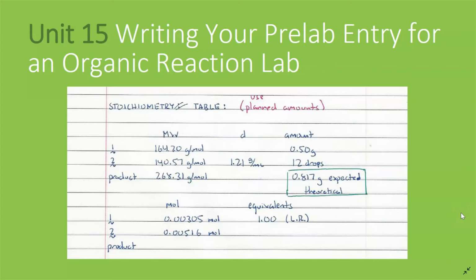Hi everyone. I made this video to show what I am looking for when I look at a student's lab notebook in organic chemistry, and especially if the lab they are doing is an organic reaction. So there are things that need to be written in the notebook before coming to lab. That's called the prelab entry. And in particular, for a reactions lab, I want my students to show a stoichiometry table.